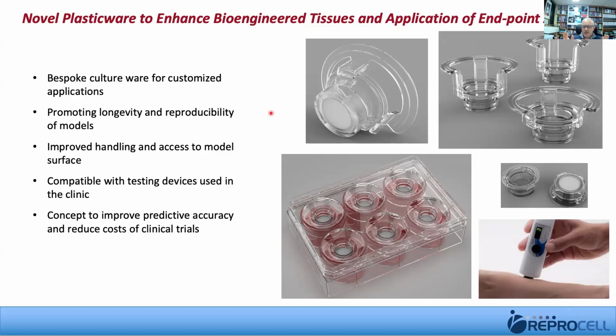And the whole concept is designed so that it improves the predictive accuracy of tests to reduce the cost in the design and application of clinical trials. So in other words, the data that you're getting from these in vitro model systems is of real value and can help make subsequent decisions on the progression of a product, or actually using the data to help promote the product as well.